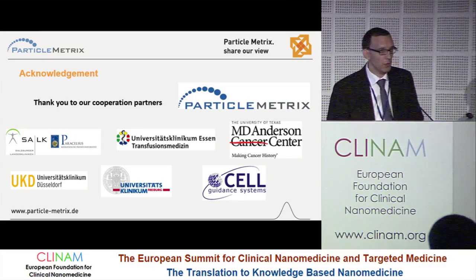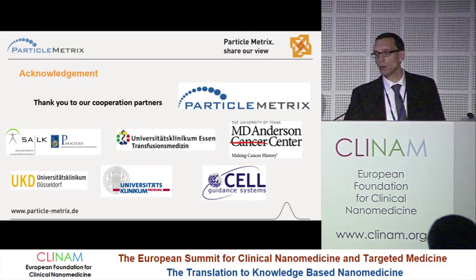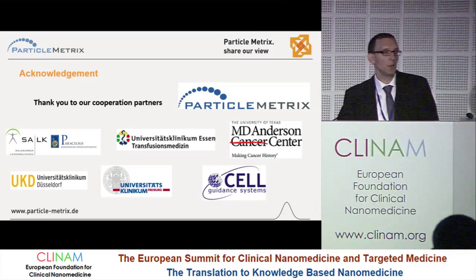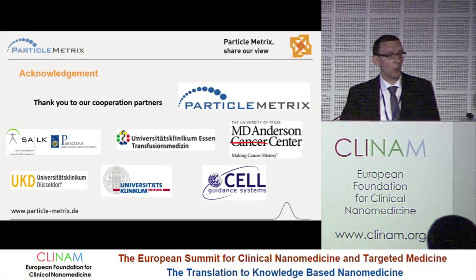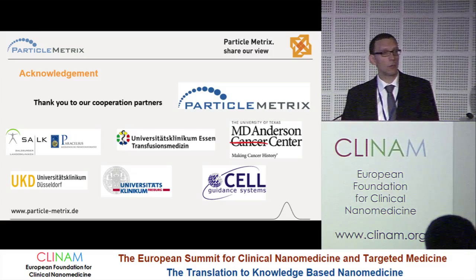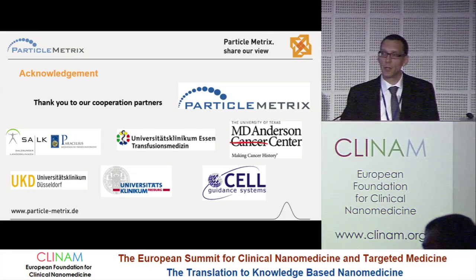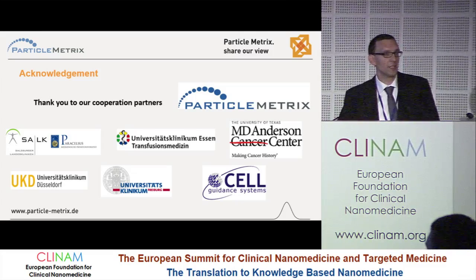Yeah, thank you for this question. You're right. Photo bleaching is crucial if you have a fluorophore absorbing light, of course if the intensity is too high or the time is too long. In this case, both are reduced to a level that photo bleaching did not occur with this sample, but I'm very aware that there are very fragile samples you have to take care of, and there are different ways to do that. We can induce a flow, so we can measure different subsamples with our instrument at up to 11 positions, and we also have a pump, so we can push the particles an increment forward. An increment is in the range of 5 to 10 microliters, and by that we avoid photo bleaching. Thank you for this question.